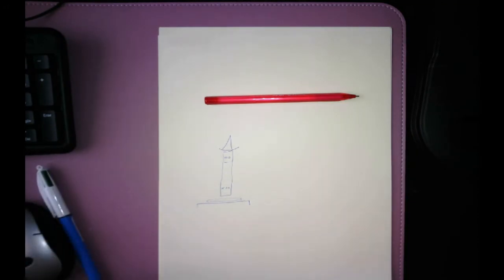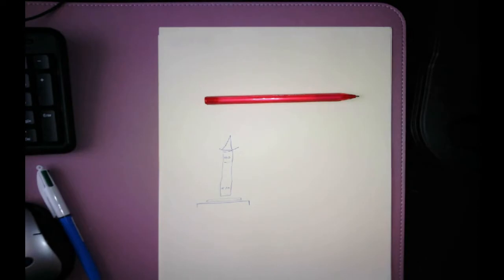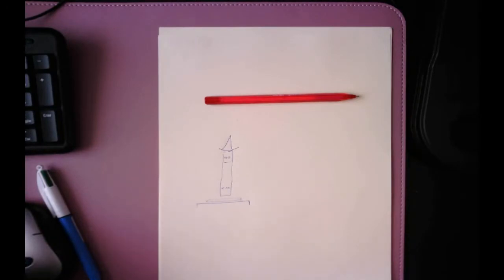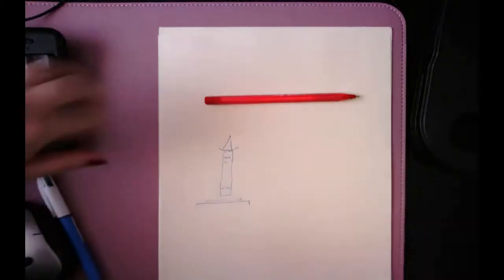Now at key stage 3, what we told you to do was to put a ruler next to the size of the object next to your eye to get an estimate of its size. Now if I do this close to my visualizer, as you can see, that's making my pen under 2 centimeters long.